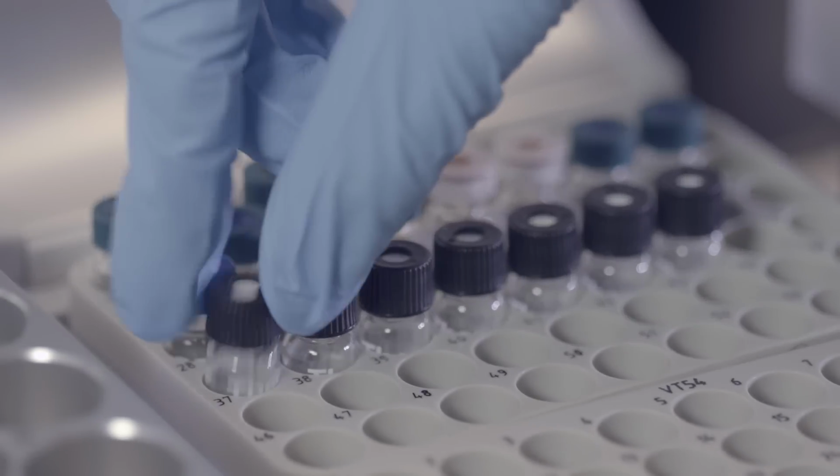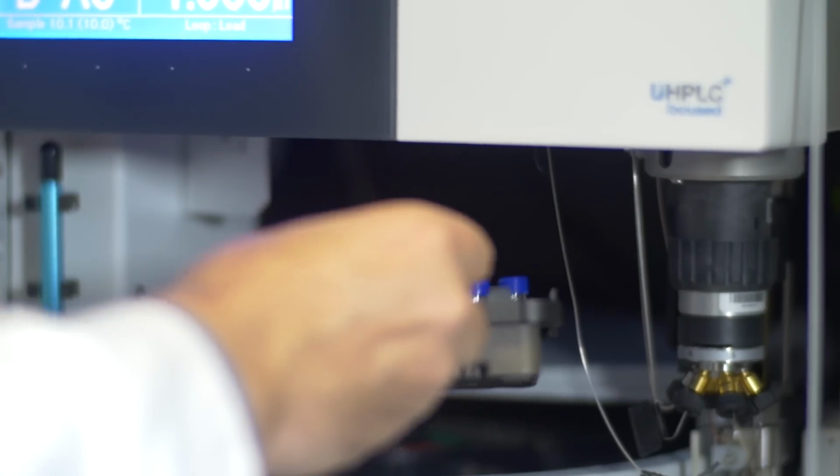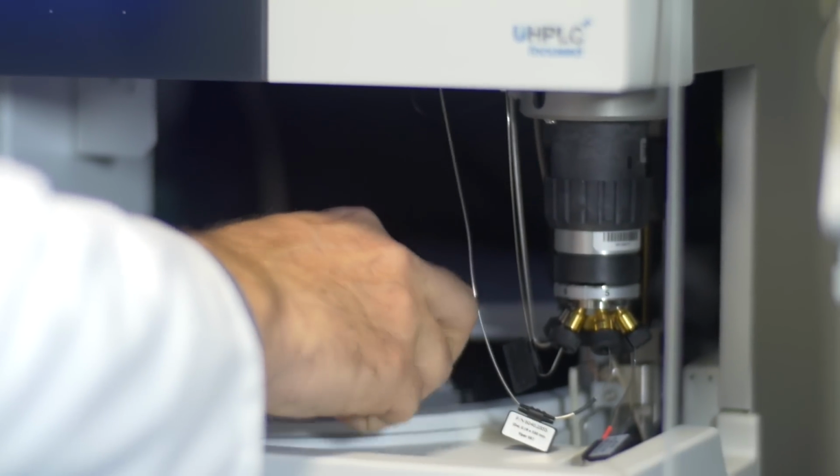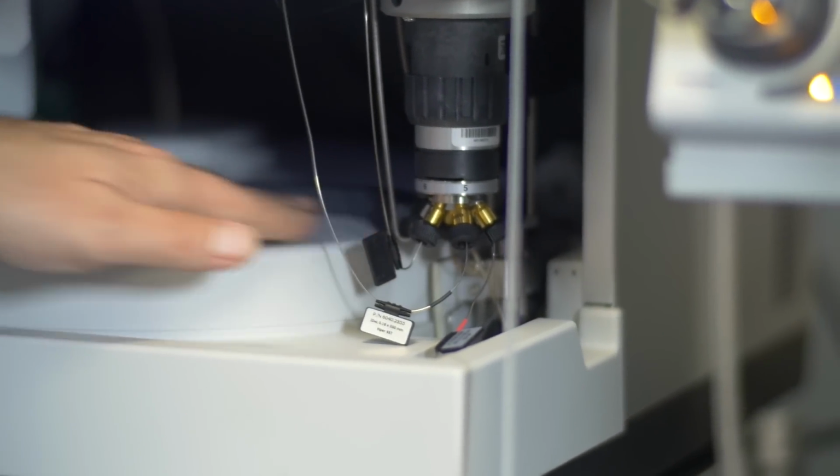One question about this, especially about the MS3 method, is the sensitivity. Can we really use this for all kinds of samples, including post-translational modifications, or including pull-down samples, IP samples, that we need to check for the interacting proteins of biomolecules?